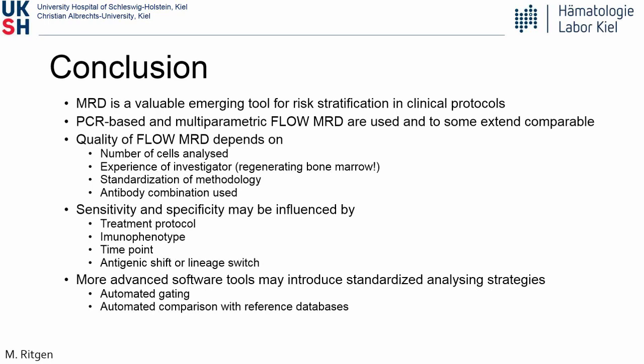Yeah, that's a very good one. Definitely on plasma cells, CD38 is very highly expressed, and usually it separates nicely. And with blasts, I think you need to compare this with the initial immunophenotype. So this definitely helps, because not all of the ALLs show very distinct CD38 expression. But at least from my perspective, it helps in combination with CD10, CD20 and CD45 expression to get an impression whether this is a reactive B-cell precursor or a malignant blast.